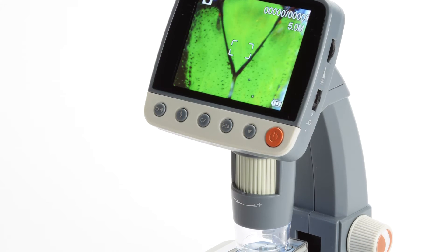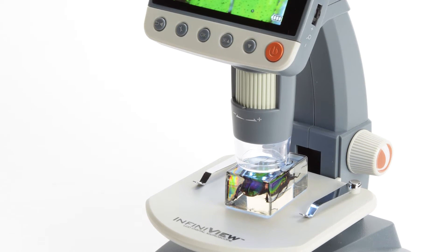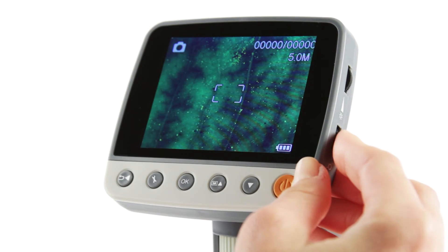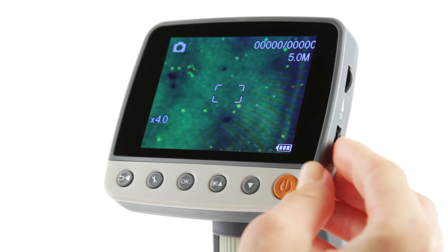A 5-element infrared-reducing glass lens combined with a 5-megapixel imaging sensor provides InfiniVue's crisp, detailed images. Get up close to your subjects from 4x to 160x magnification, or add the 4x digital zoom for even more power.